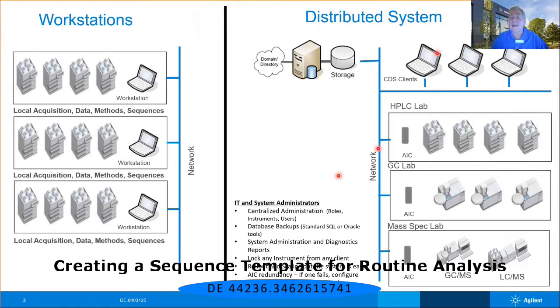I can lock any of these instruments from any client. This is a very important aspect because, again, let's say my client here is sitting in my office, which is 3 doors down from my laboratory. I'd like to start this HPLC. Unfortunately, I don't realize that my colleague has got the pump head out and they're currently changing out the pump seals. So before they begin that process, they lock that instrument.